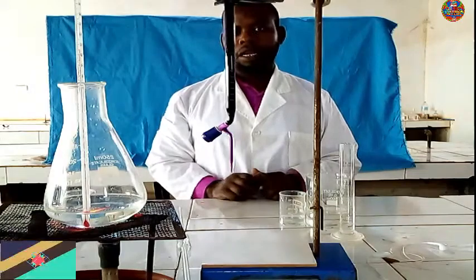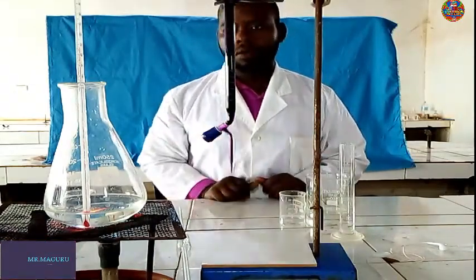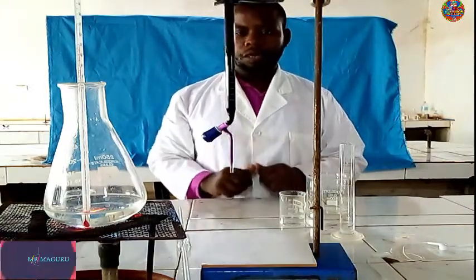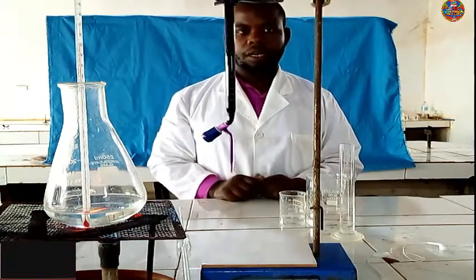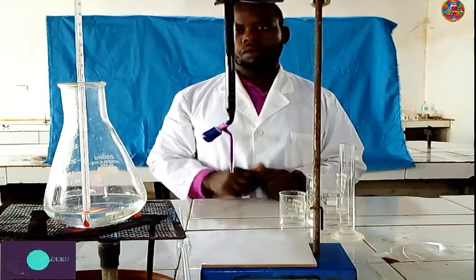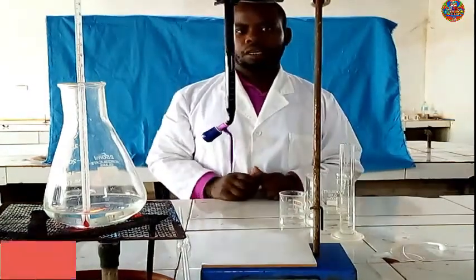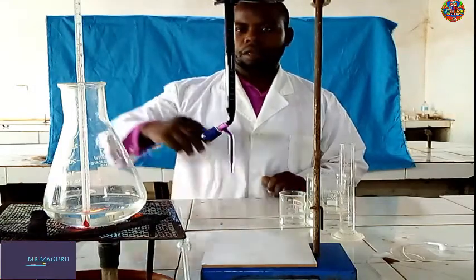Before doing this, I have already taught the theory. If you are not ready for that theory, you can communicate with me to give you that tutorial. And after this experiment, we are going to solve this question to find the water of crystallization of oxalic acid.